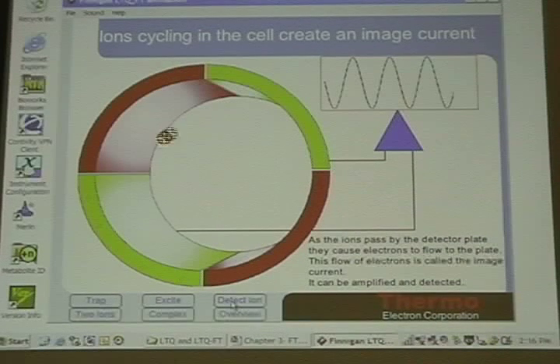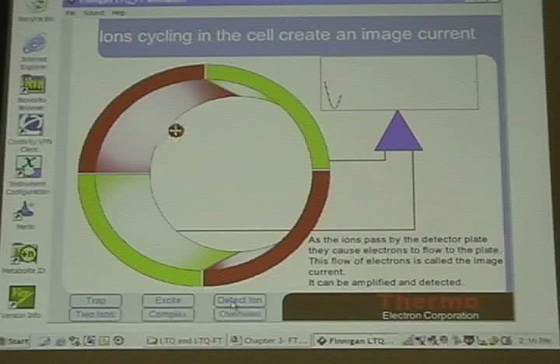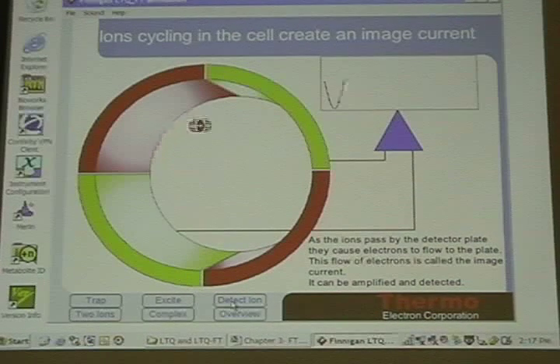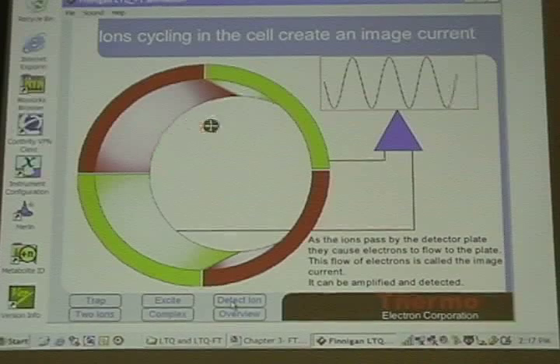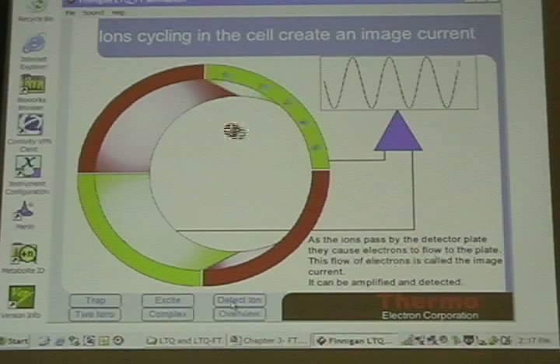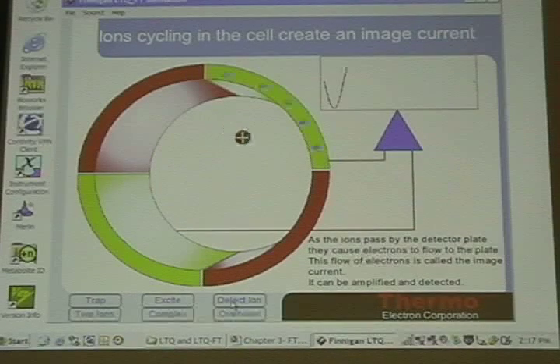Centroid is even better yet, but people don't believe centroid data on an FT. All I ever run is centroid data on my LTQ. The minute you throw an FT up, people want to see where's my peak width. People associate centroiding with resolution. There's nothing wrong with centroiding because we centroid properly. That would be even better. Most people don't believe that though. If they're using high resolution, they want to see peak shape. I've never seen anyone use the peak shape for information, but they want to see it. So we're always pushed: it's got to be profile mode data.